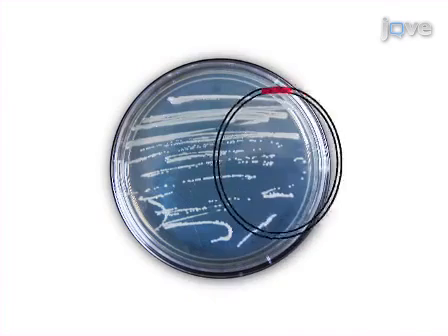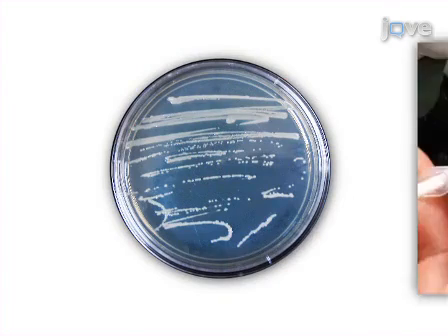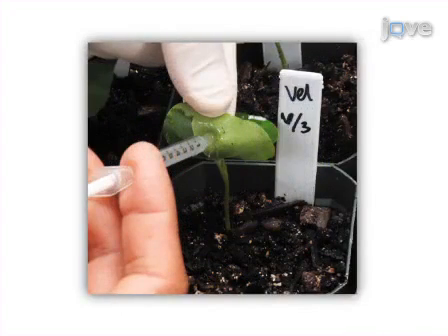The third step is to prepare agrobacterium cultures containing PTRV RNA1 and PTRV GRCLA1. The final step is to hand inoculate the agrobacterium cultures into cotton cotyledons.